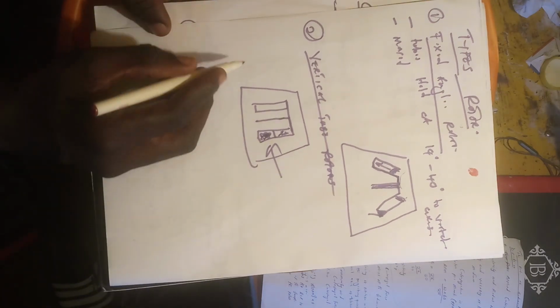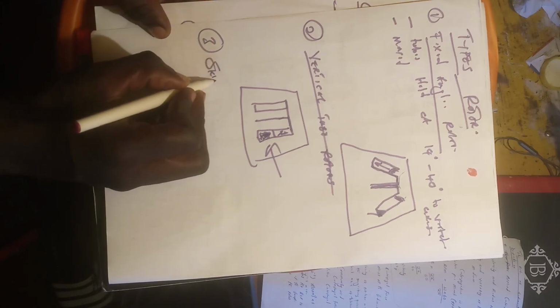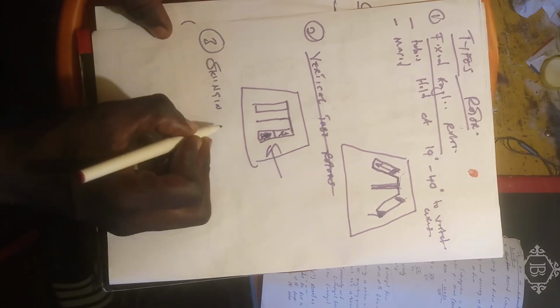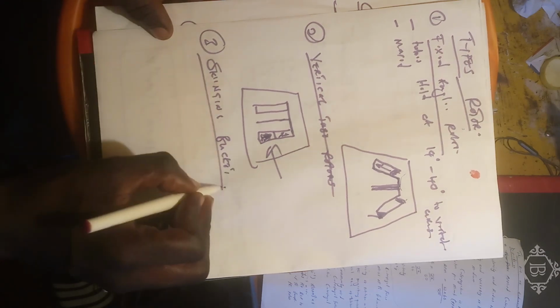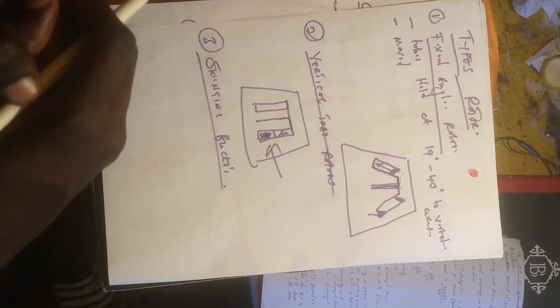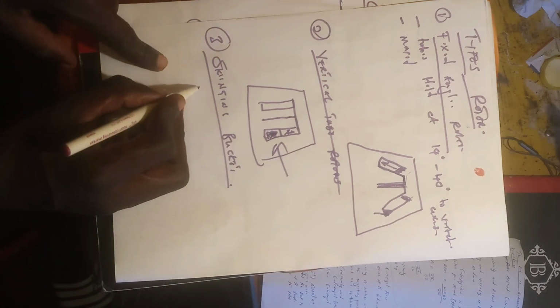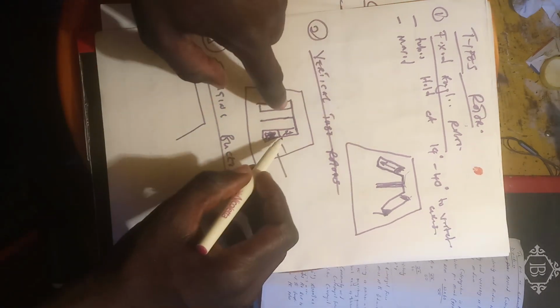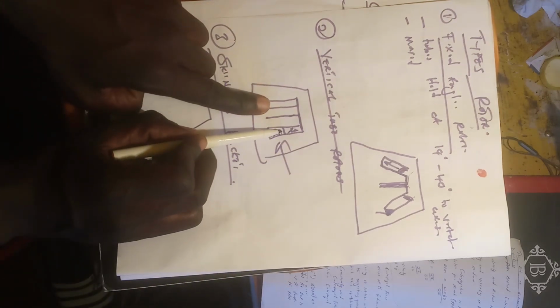Then we have the third type of rotor, which is the swinging bucket rotor. With the swinging bucket rotors, what happens is that initially, before the centrifugation process starts, they are held in a vertical position.